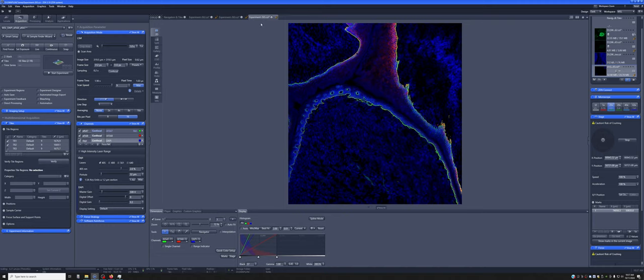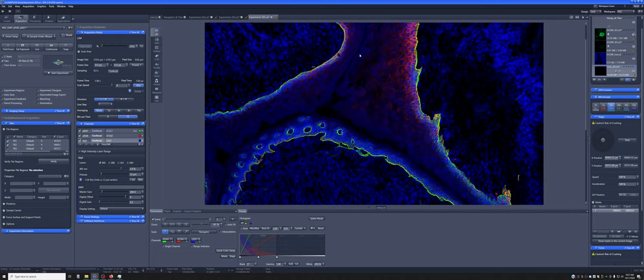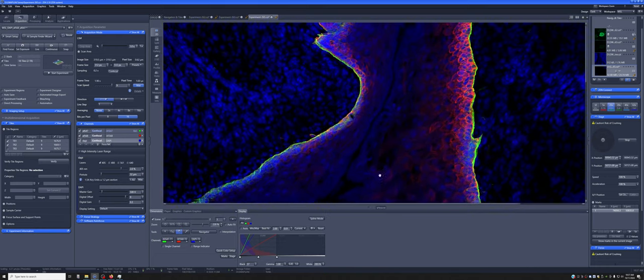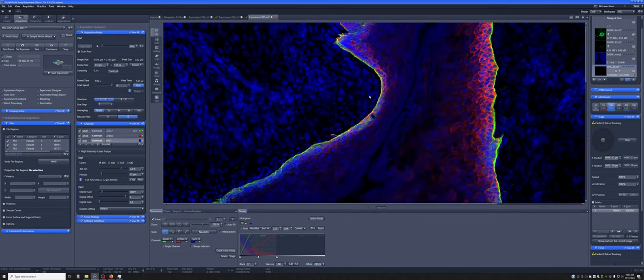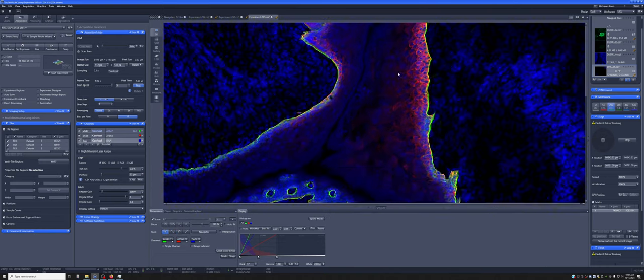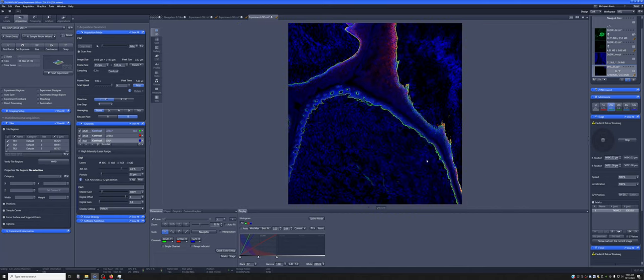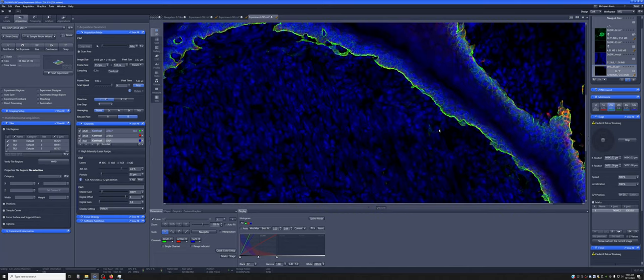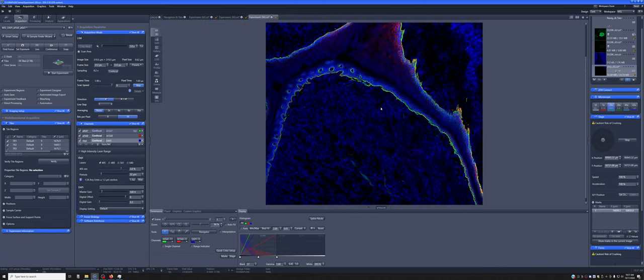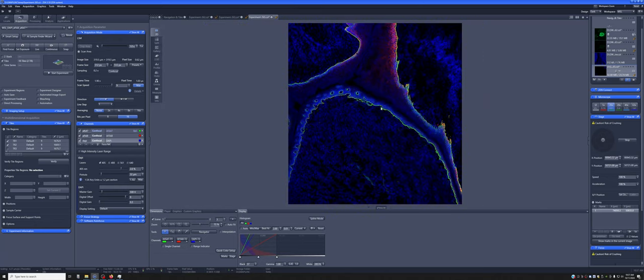But so once you have this, one thing that you want to do is actually stitch it. So you want to take this image, which is actually nine images placed next to each other. I can't actually see the seams that well. But if you look very closely, you may see imperfections where two of the images were adjacent to each other. And so we want to get rid of those imperfections.